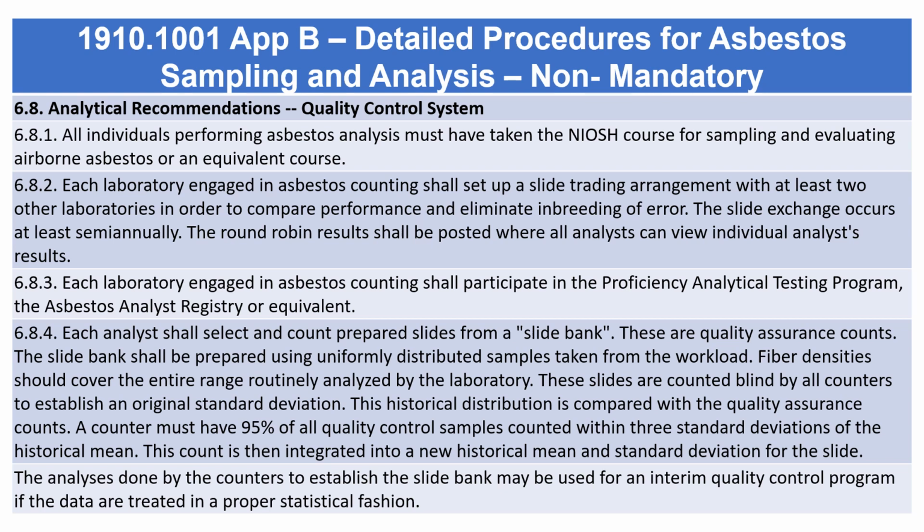This count is then integrated into a new historical mean and standard deviation for the slide. The analyses done by the counters to establish the slide bank may be used for an interim quality control program if the data are treated in a proper statistical fashion.